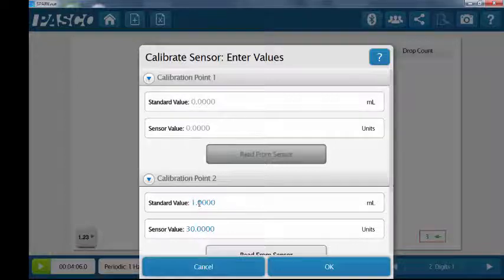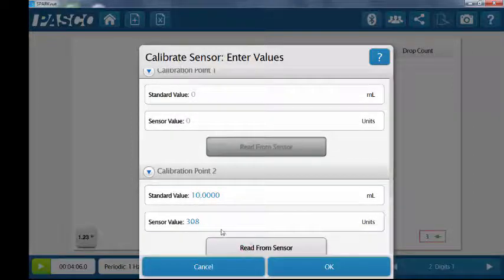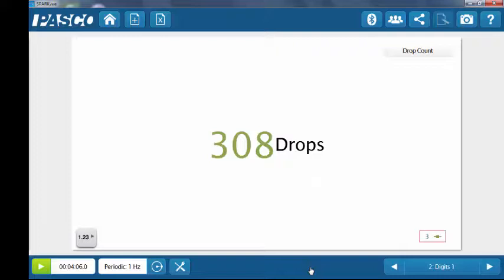And in calibration point 2, enter the volume collected in the graduated cylinder, which here was 10.00 milliliters. And then click read from sensor. The drop count should be automatically entered into the sensor value box. Click OK, and the calibration is complete.